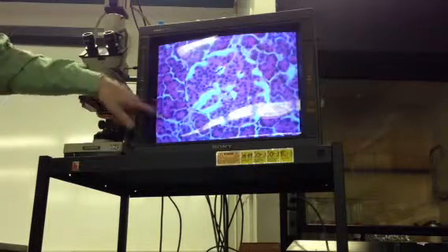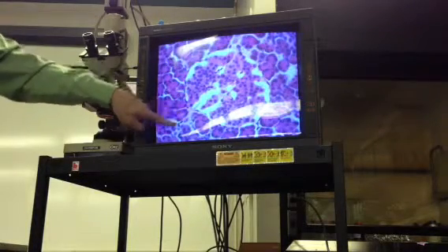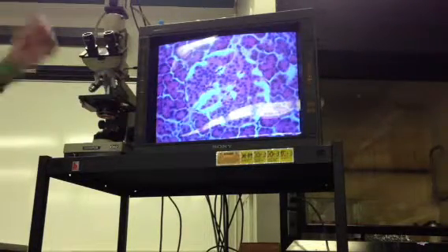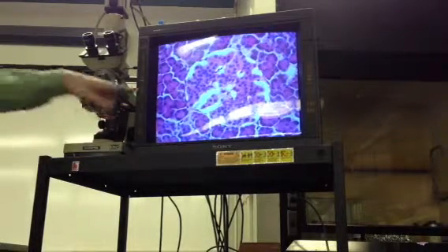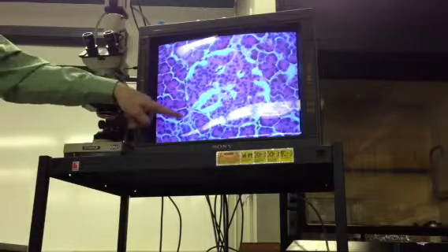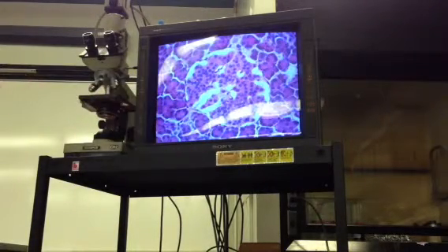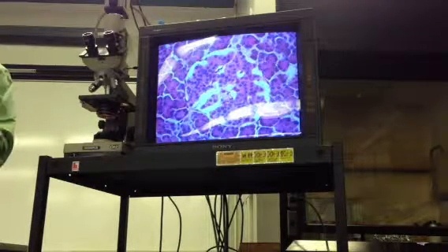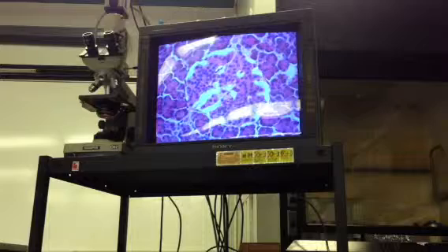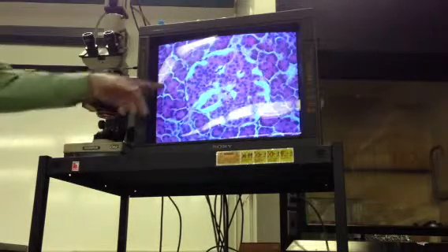But anyway, you see how the nuclei are all around the periphery. You can't really see the cell boundaries very easily, but if you focus carefully, you can see how they're like 5 or 6 slices of the pie. What's in the center is a very thin tubule that ultimately opens up into the pancreatic duct, which goes into the common bile duct and into the duodenum, because that's the route the enzymes take, which is what these cells make.